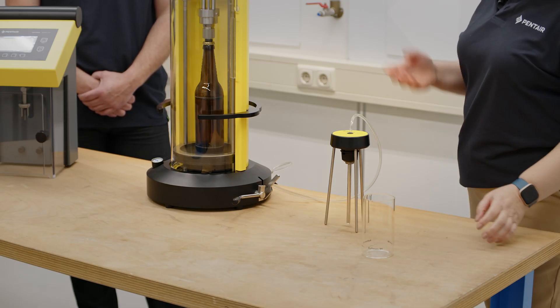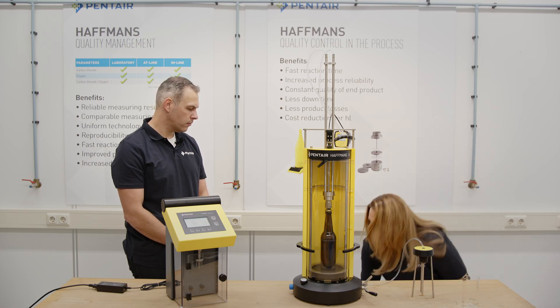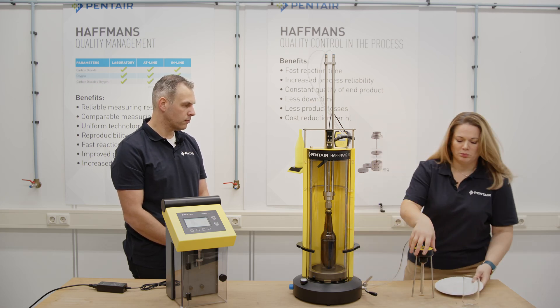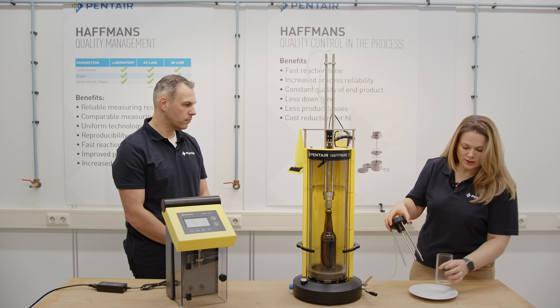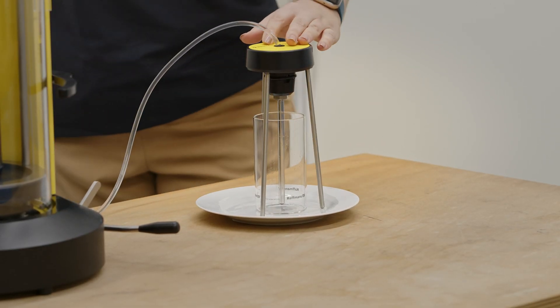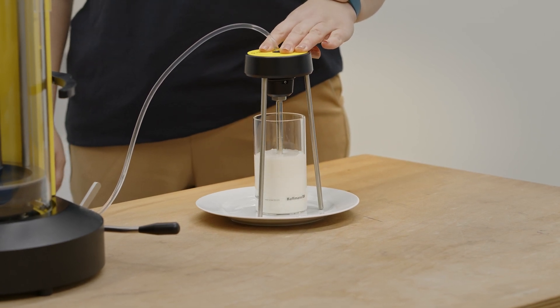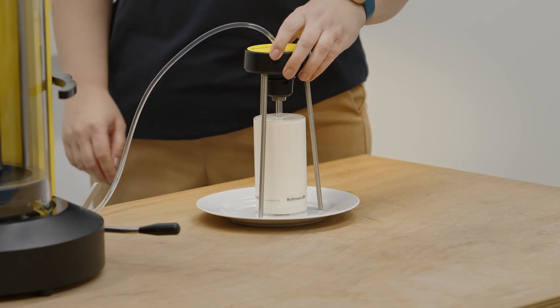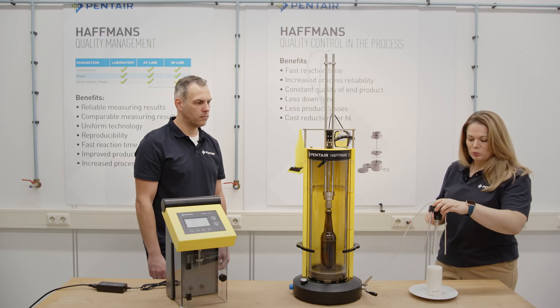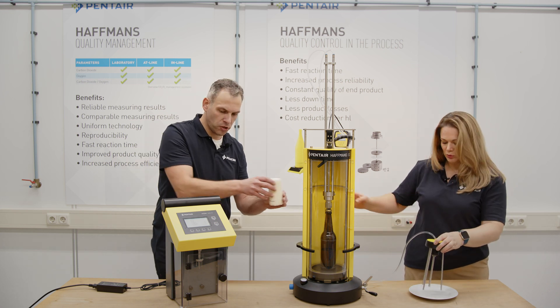Okay, thank you, Frank. So the bottle is ready to take a sample. We are going now to prepare everything. We take a glass, which is part of the supply from the Nibem TPH, and we just have to push to create the foam. Once the foam is created, we put it in our Nibem TPH and can make the measurement. Frank, can you please put it?